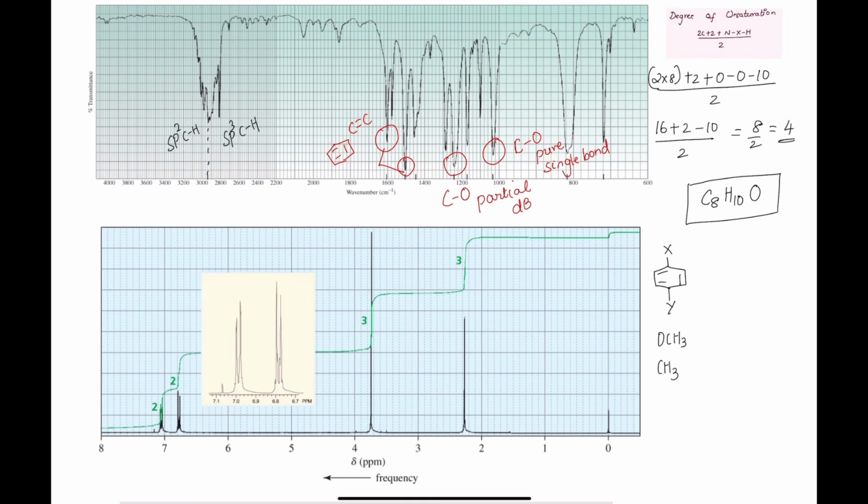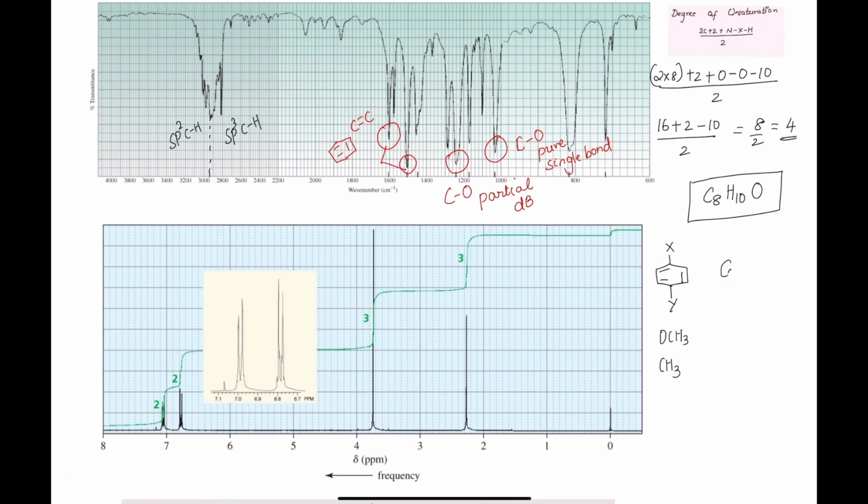We want to calculate all of these carbons, hydrogens, and oxygen and see whether this is consistent with our given molecular formula. For the para-disubstituted benzene ring, the molecular formula is C6H4, since 2 of the hydrogens have been replaced by 2 substituents. And we have an oxygen from the OCH3 group, and the total number of carbons and hydrogens from the two groups is C2 and H6. So on the whole, it's C8H10O, which is definitely consistent with the given formula.